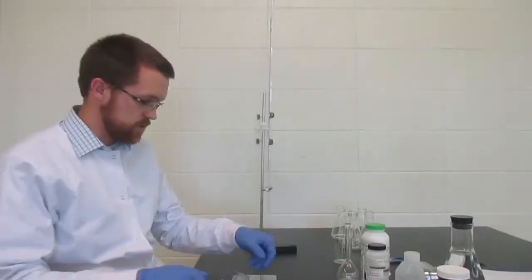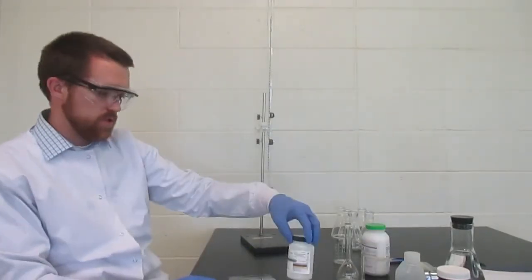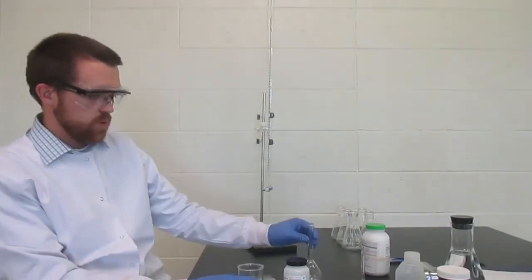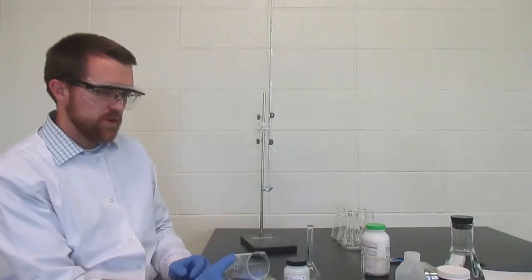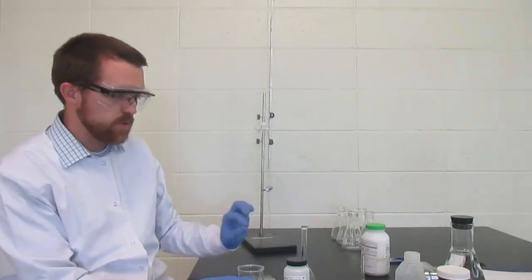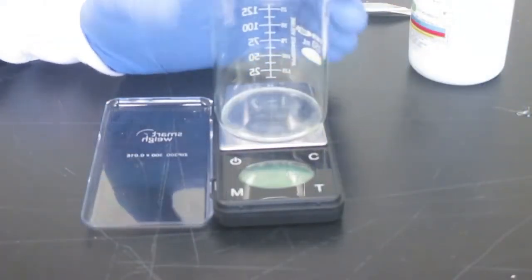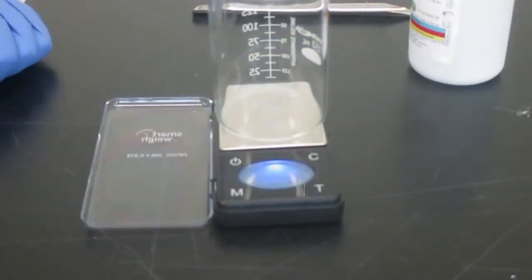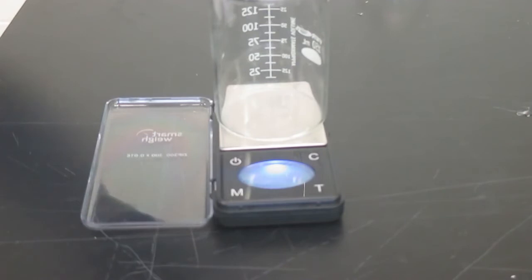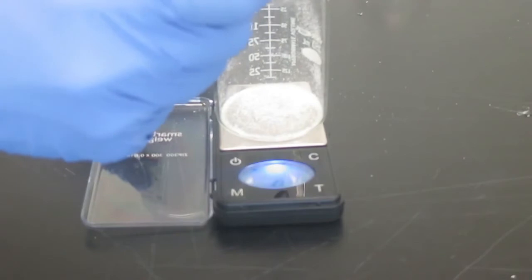Alright, so let's make our standard solution of KHP. We will have to dissolve our 3.06 grams in exactly 100 mils of water. So we will weigh out 3.06 grams first, dissolve it in about 50 mils or so, pour it into our volumetric flask so that we can get a very precise measurement of 100 milliliters. Okay, so we'll start with zeroing our beaker on the scale.